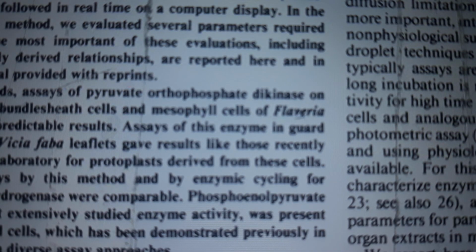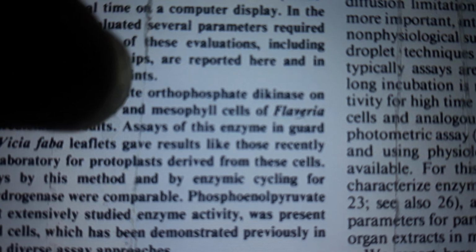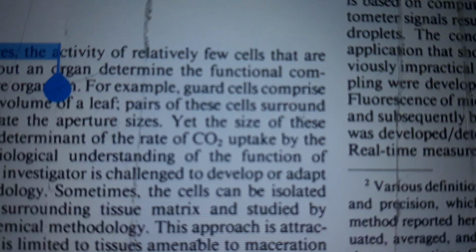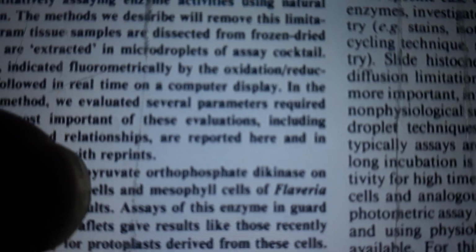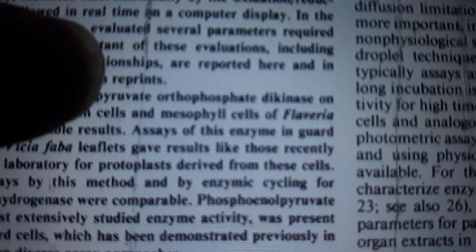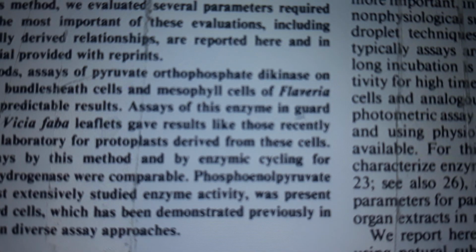In the more specific case of quantitative assays of minute amounts of enzymes, investigators have been restricted to slide histochemistry, for example stains and isotopes, and microdroplet chemistry, for example the cycling technique, spectrophotometry, luminometry, fluorometry.